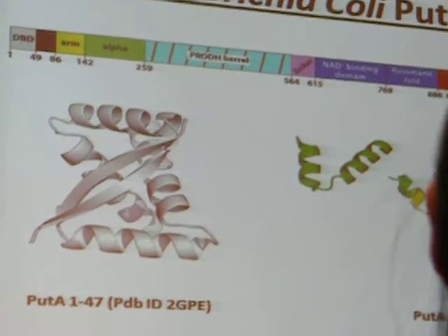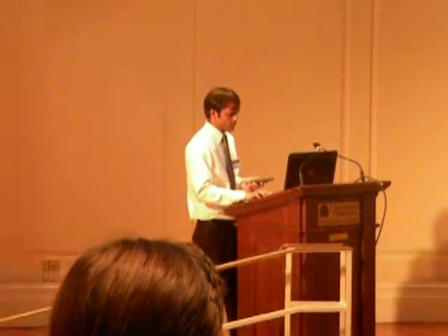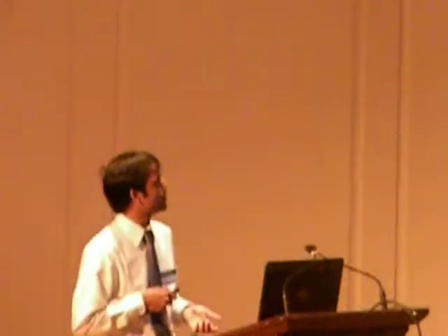But the C-terminal structure and the overall structure of the trifunctional protein was always elusive. So of course, the first thing to do was to attempt crystallization of the full-length trifunctional protein and check the oligomeric state of the protein, and of course, the crystallization step was a sad story for me.